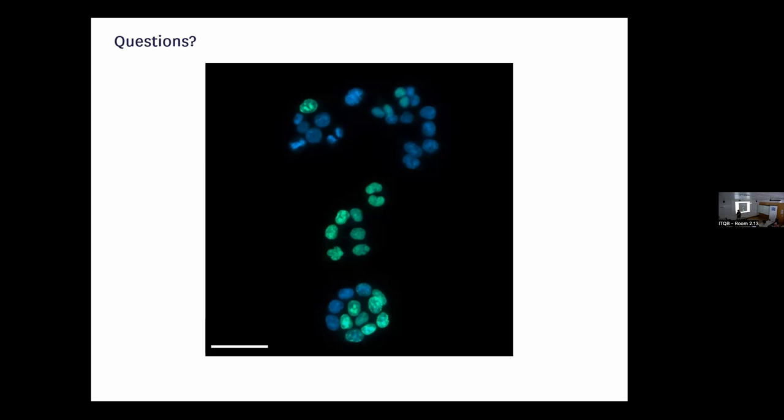Yeah. I was wondering, are there any examples in which FRET is not quite desirable? I was thinking about membrane binding fluorophores.